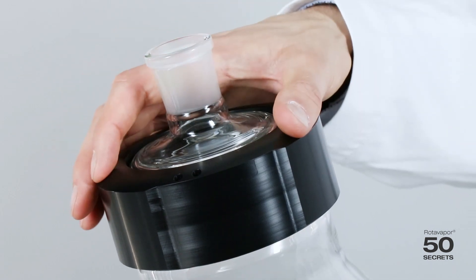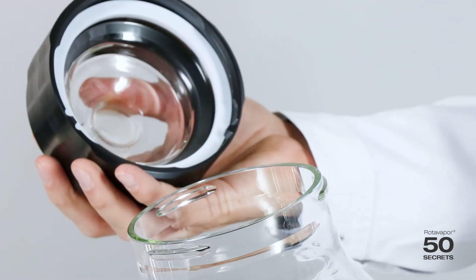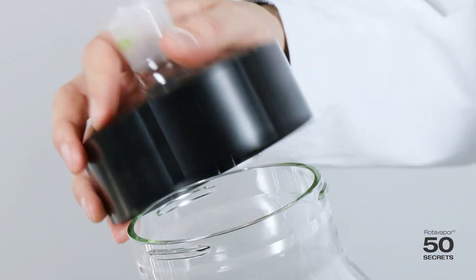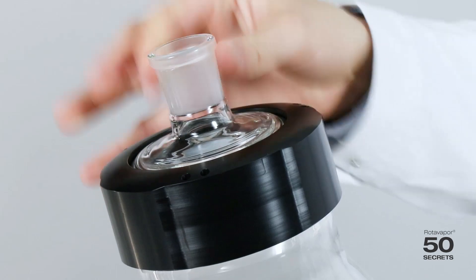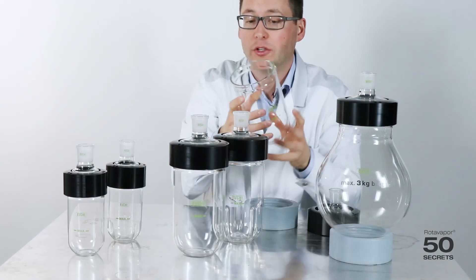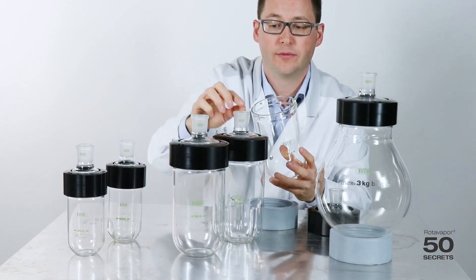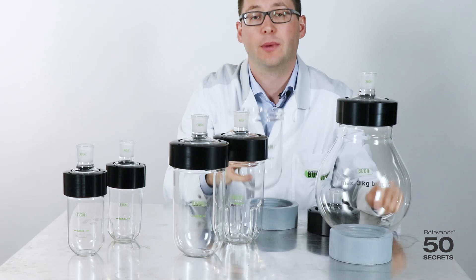You simply hold here, you push it down, you turn, you take it off and that's it. You can now easily reach into the flask. To close it, same procedure — you push and turn and that's it. So in order to remove or add difficult substances you don't need to push them through the normal joint, but you can just simply put them in and get them out again.